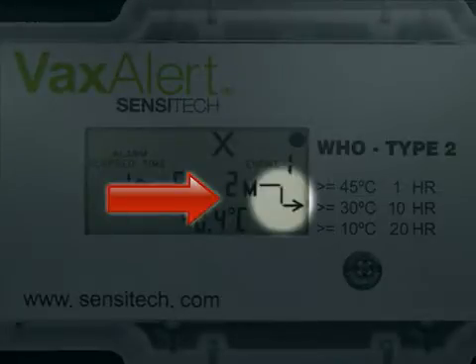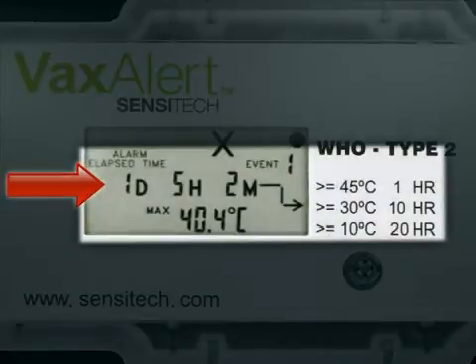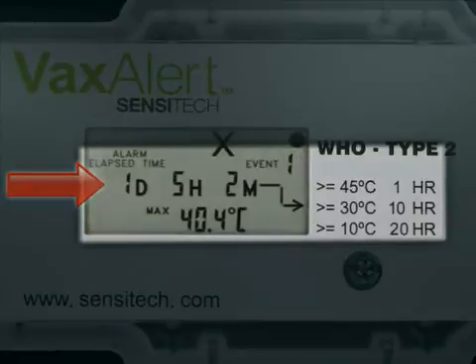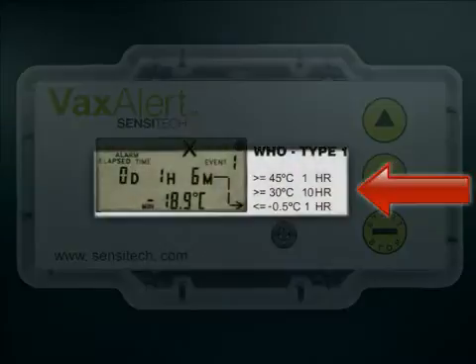The alarm violation for this event is greater than 30 degrees Celsius, 10-hour alarm at 1 day, 5 hours, and 2 minutes elapsed time. The maximum temperature recorded during this 30 degrees Celsius 10-hour alarm event is 40.4 degrees Celsius. In another example, the first alarm violation for this trip is less than minus 0.5 degrees Celsius, 1-hour alarm at the 0 day, 1 hour, 6 minutes elapsed time. The minimum temperature recorded during this event is minus 18.9 degrees Celsius.